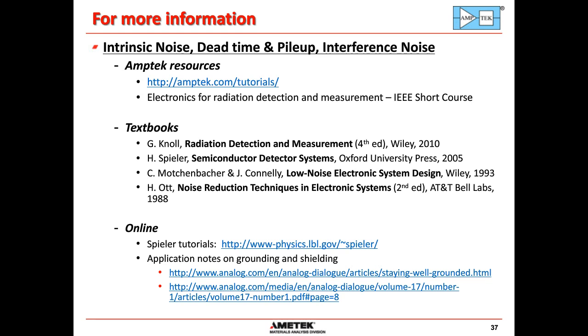Let's see. There was also a question about temperature and trying to reach the lowest energy limit. Say you want to get down to 120 eV. If you're trying to measure X-rays at 120 eV, that can certainly be done. The first key is to pick the right detector. The fast SDDs have much lower noise, down around 30 or 40 eV full width half maximum. So pick the fast SDD.